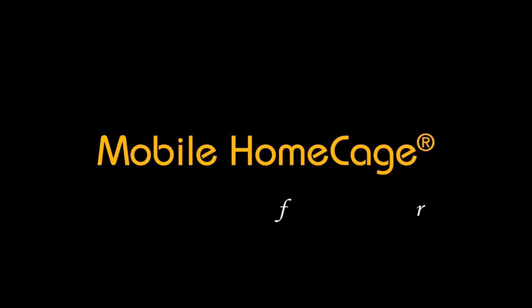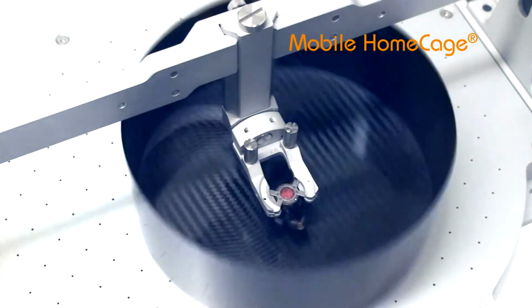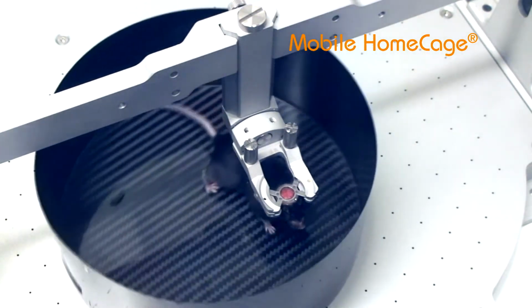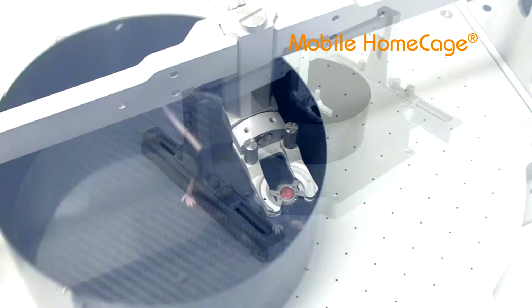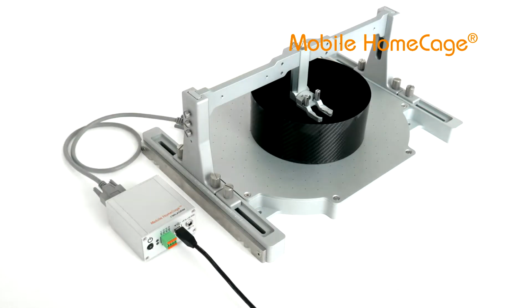Researchers used the Mobile HomeCage for head-fixing awake mice during microscopic imaging, single-cell electrophysiology, optogenetic stimulation, and functional ultrasound recordings. Some researchers combine these techniques with simple behavioral readouts. To enable more complex behavioral analysis, we have recently added locomotion tracking capabilities.